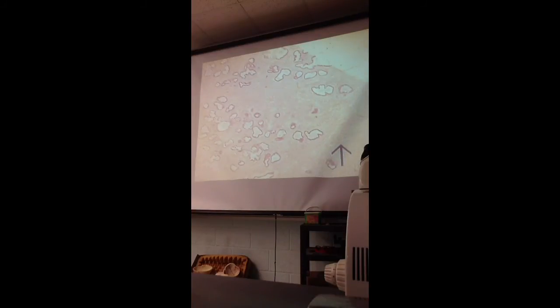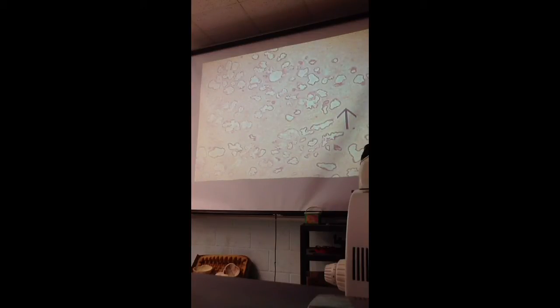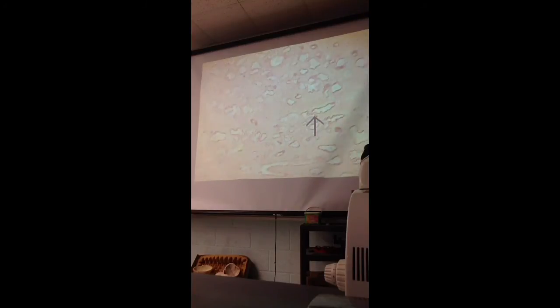This is a section taken through a young prostate. It has lots and lots of glands, and is actively producing secretions. The best way to identify it is looking at the fibromuscular stroma. Now to contrast this, I am putting up another slide of a prostate that is of an old person.